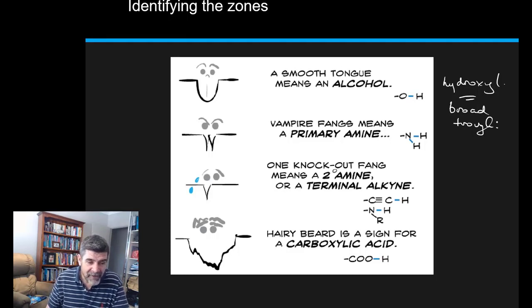A knockout fang is the secondary amine. Secondary amines occur exactly the same as secondary alcohols - that means they're attached to a carbon that is attached to two other carbons. There's also a terminal alkyne which is another way of getting this little knockout fang. And then there's the hairy beard which is a sign for the carboxylic acid.